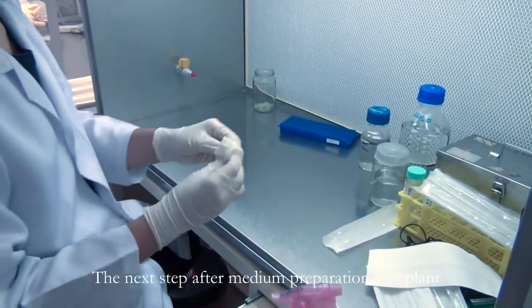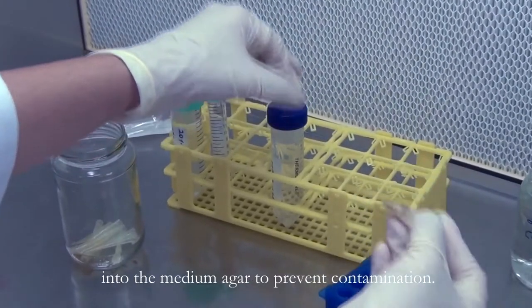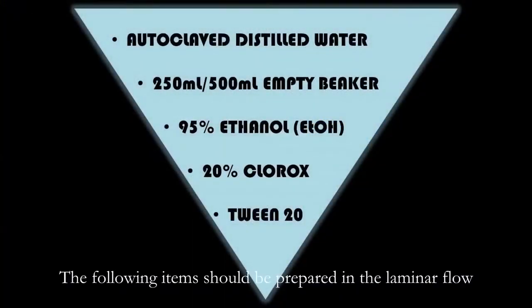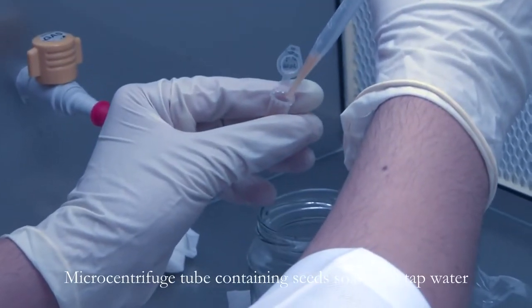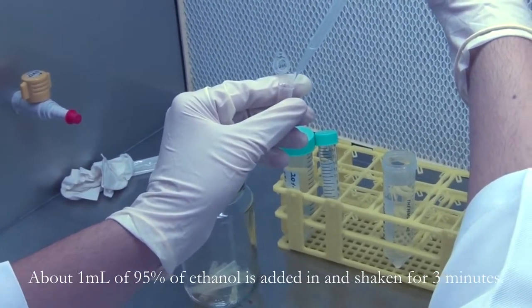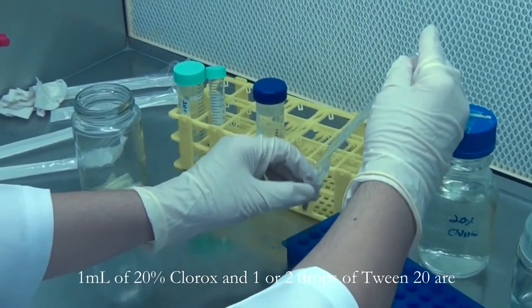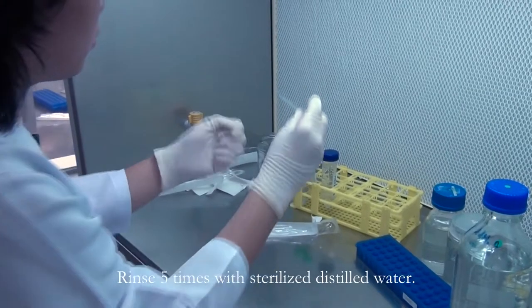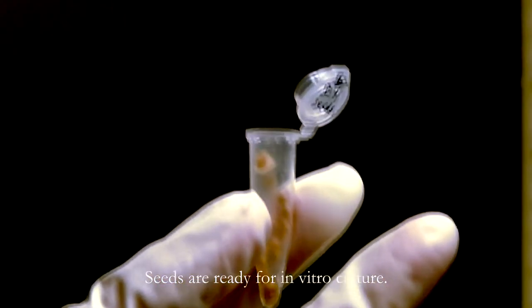The next step after medium preparation is explant preparation and inoculation. Explant needs to be surface sterilized before being inoculated into the medium agar to prevent contamination. This process has to be done in a sterilized laminar flow. A micro centrifuge tube containing seeds soaked in tap water and incubated overnight is dewatered. About 1 ml of 95% ethanol is added and shaken for 3 minutes. After 3 minutes, the ethanol is decanted. 1 ml of 20% Clorox and 1 or 2 drops of Tween 20 are added and shaken for 10 minutes. Rinse 5 times with sterilized distilled water. Decant the water and leave the seeds in the laminar hood to dry. Seeds are ready for in vitro culture.